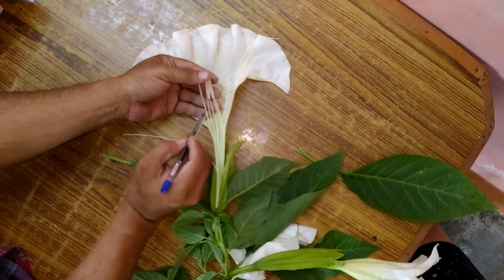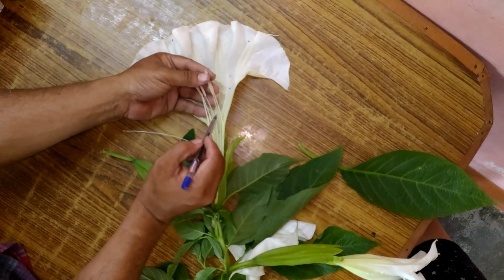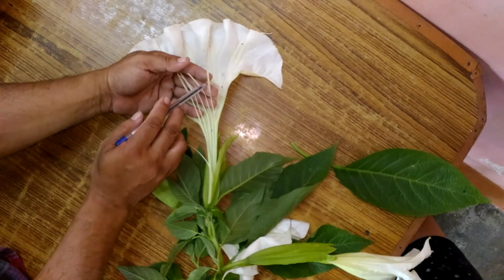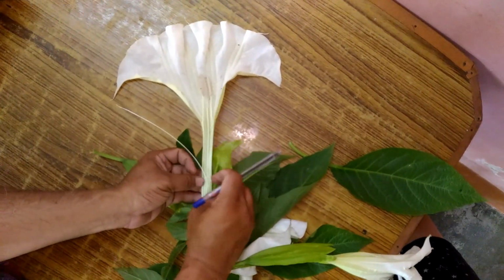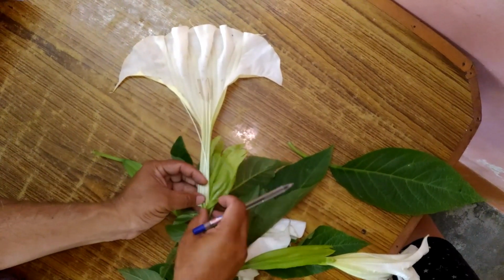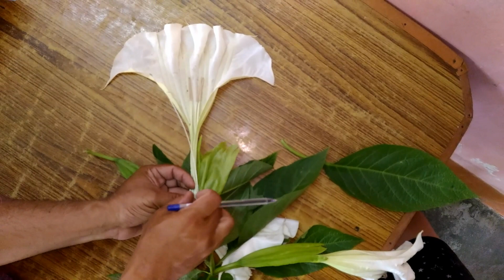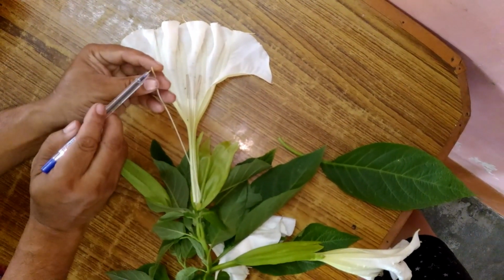Now I am separating the anthers. So 5 epipetalar stamens are observed here, and this one is the gynoecium, ovary, then long style, and this one is the stigma.